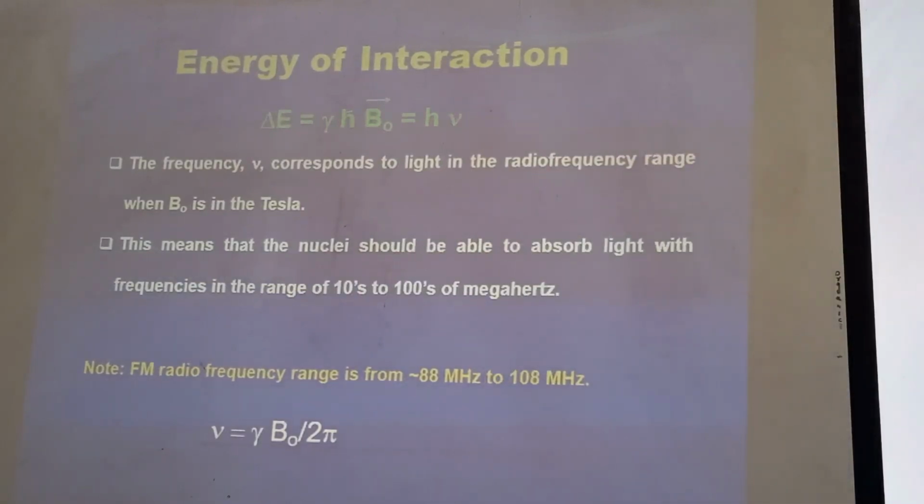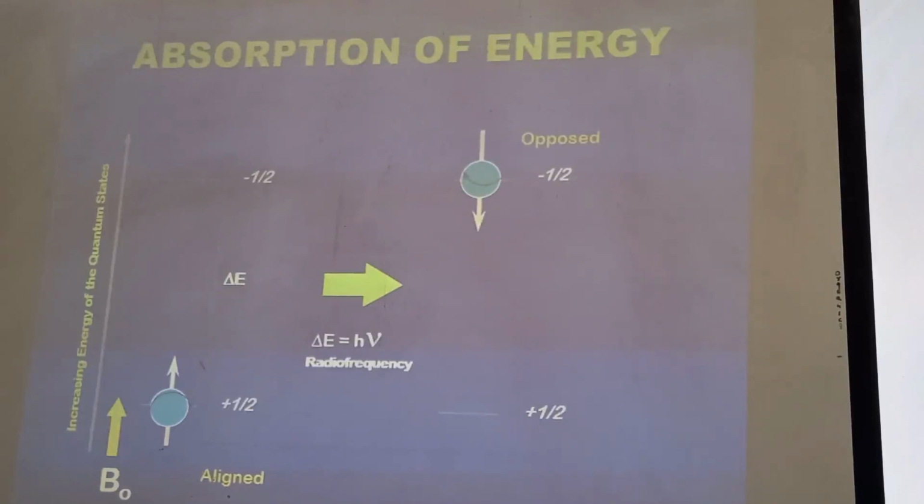The radio frequency is also directly related to B naught, because to match that higher Larmor frequency, you have to provide higher radio frequency as well. And we will see that in a moment.